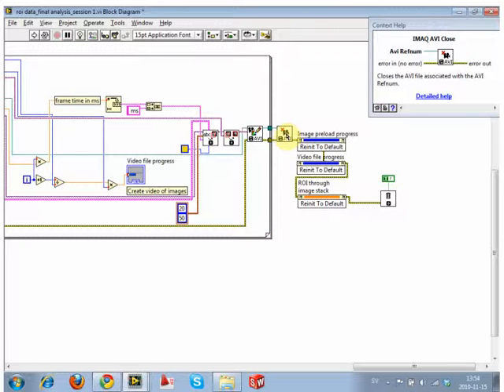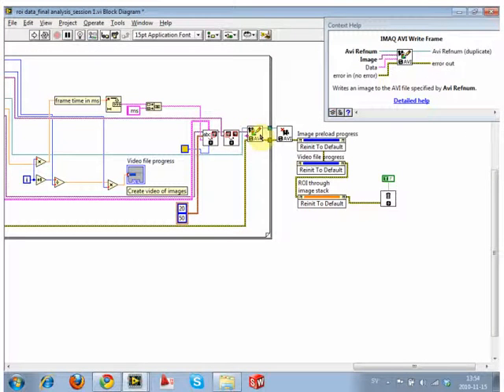Almost always, when you're building an AVI, you'll be inside a for loop, because it has to put them in frame by frame. It has to open the frame, put it in the container, and then the for loop clicks over, and then it puts the next one in the container, clicks over, puts the next one in the container. You can't just dump stuff into it. It has to be able to order them in a certain way.